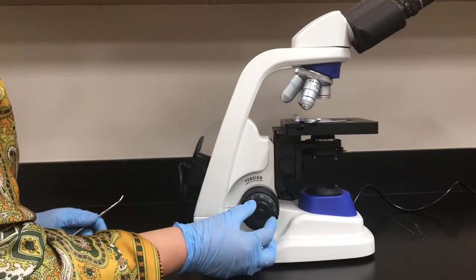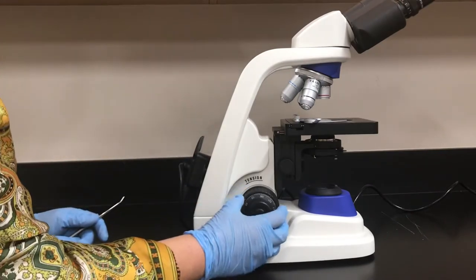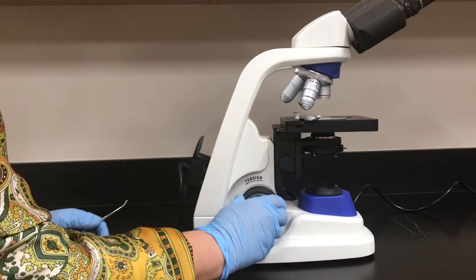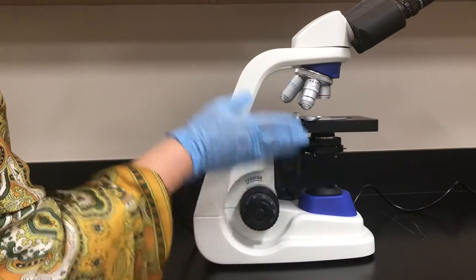Here we have two knobs. This is the coarse focus knob, and this is the fine focus knob. When we turn the coarse focus knob, you see how fast your stage goes up and down.